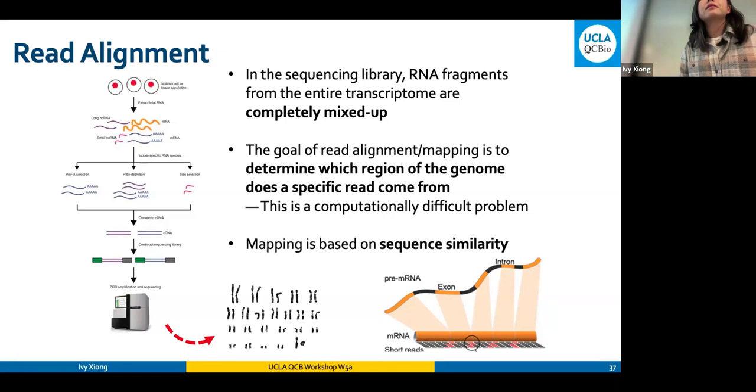You said the fragments that were mapping to the reference genome, those are just exons, right? The reference genome has everything, but annotation would actually make sure that you know where the exons are, right? Yeah, because the thing that we're mapping to the reference are only exons, right? Not really. So the reference genome for the human, we know how big that is. It's 3 billion base pairs. So it's actually the entire sequence.